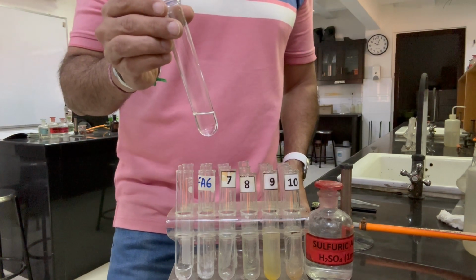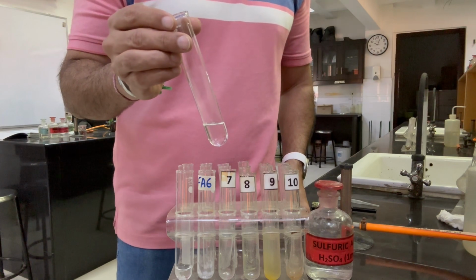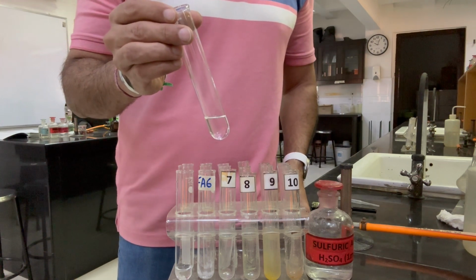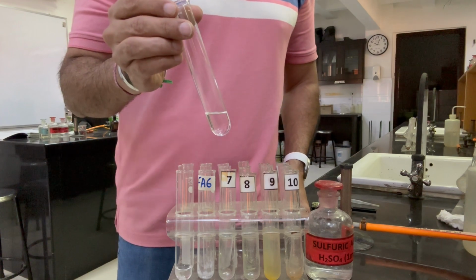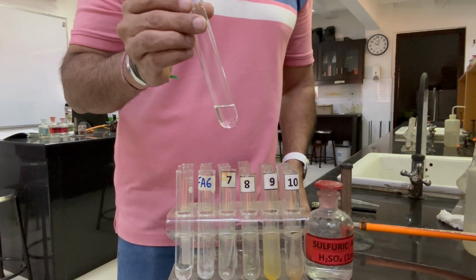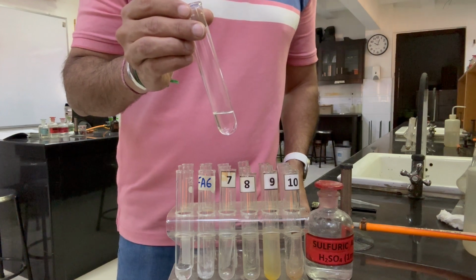Now we want to test the gas liberated, because every time we have any gas liberated, we have to test and identify that gas. Sulfur dioxide is a reducing agent as well as a bleaching agent. So to test the presence of a reducing agent, we can use potassium permanganate, which gets reduced and decolorized.